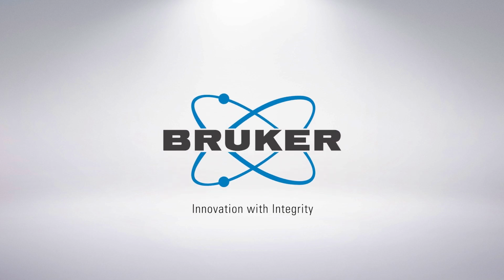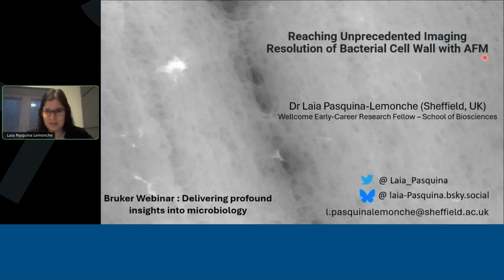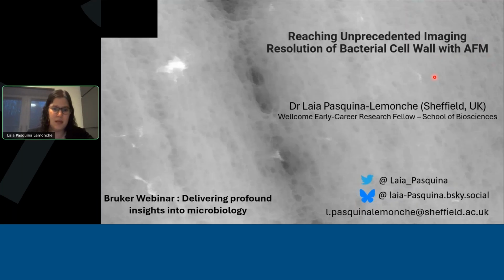Today's talk is a bit more methodological than I usually do. I will talk a little bit about the science, but I'm basically trying to explain how we can reach unprecedented imaging resolution of the bacterial cell wall with AFM.